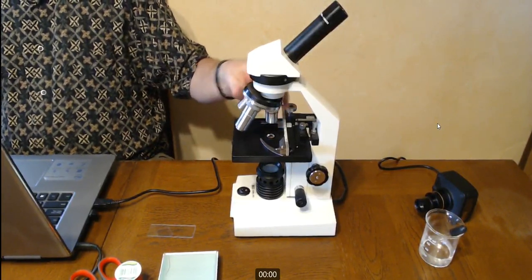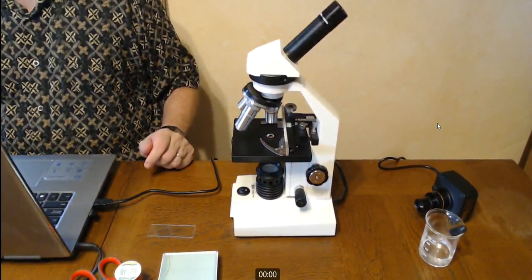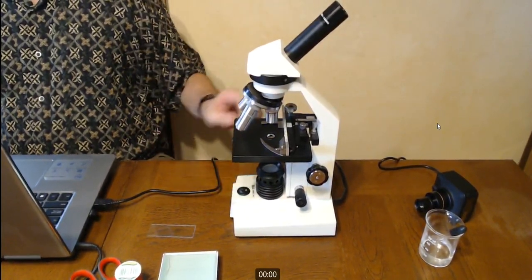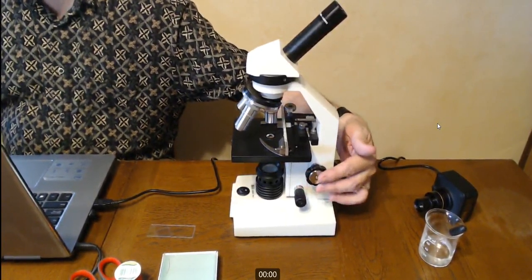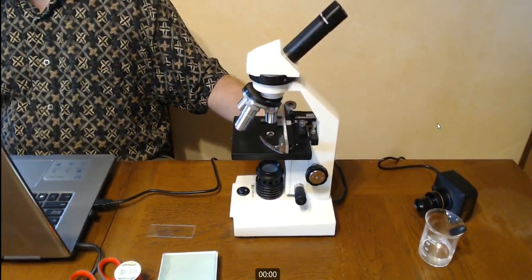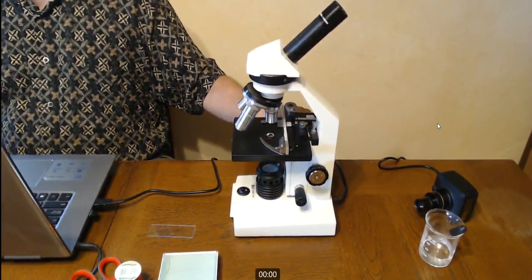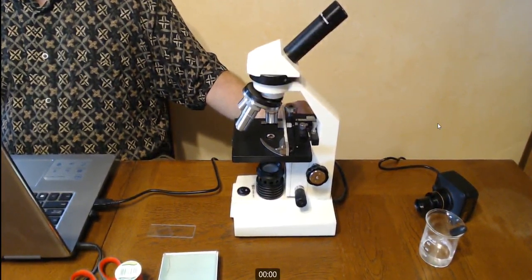When you start with the microscope, the lower power objective should be down. Under the objective is the stage. This is the part you move up and down to focus. You've got 2 different knobs. The large, or coarse adjustment, moves the stage a lot. If you have the high power down when you're doing this, you run the risk of slamming the stage into the objective and damaging it. So that's why we always start with the low power down.